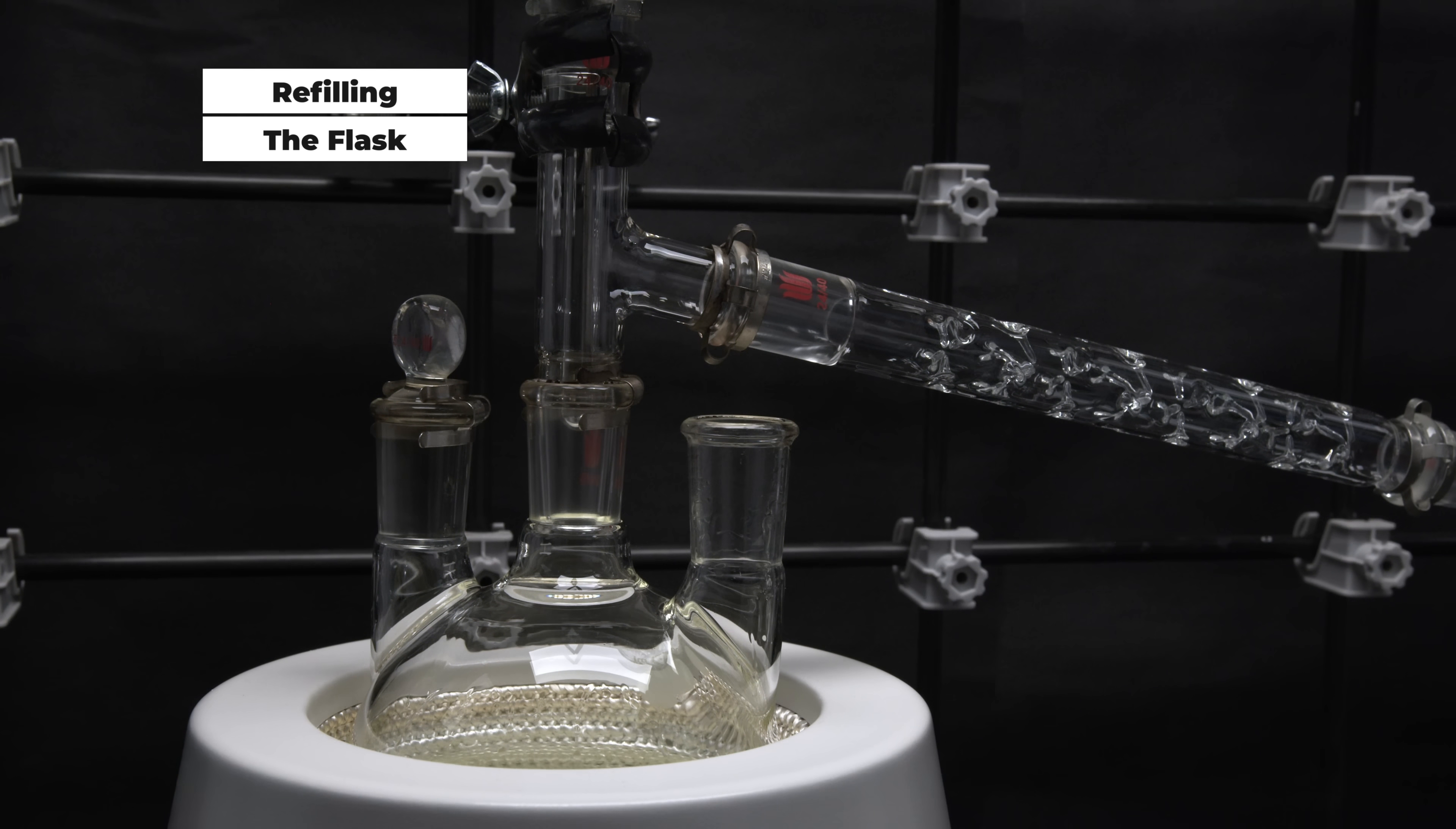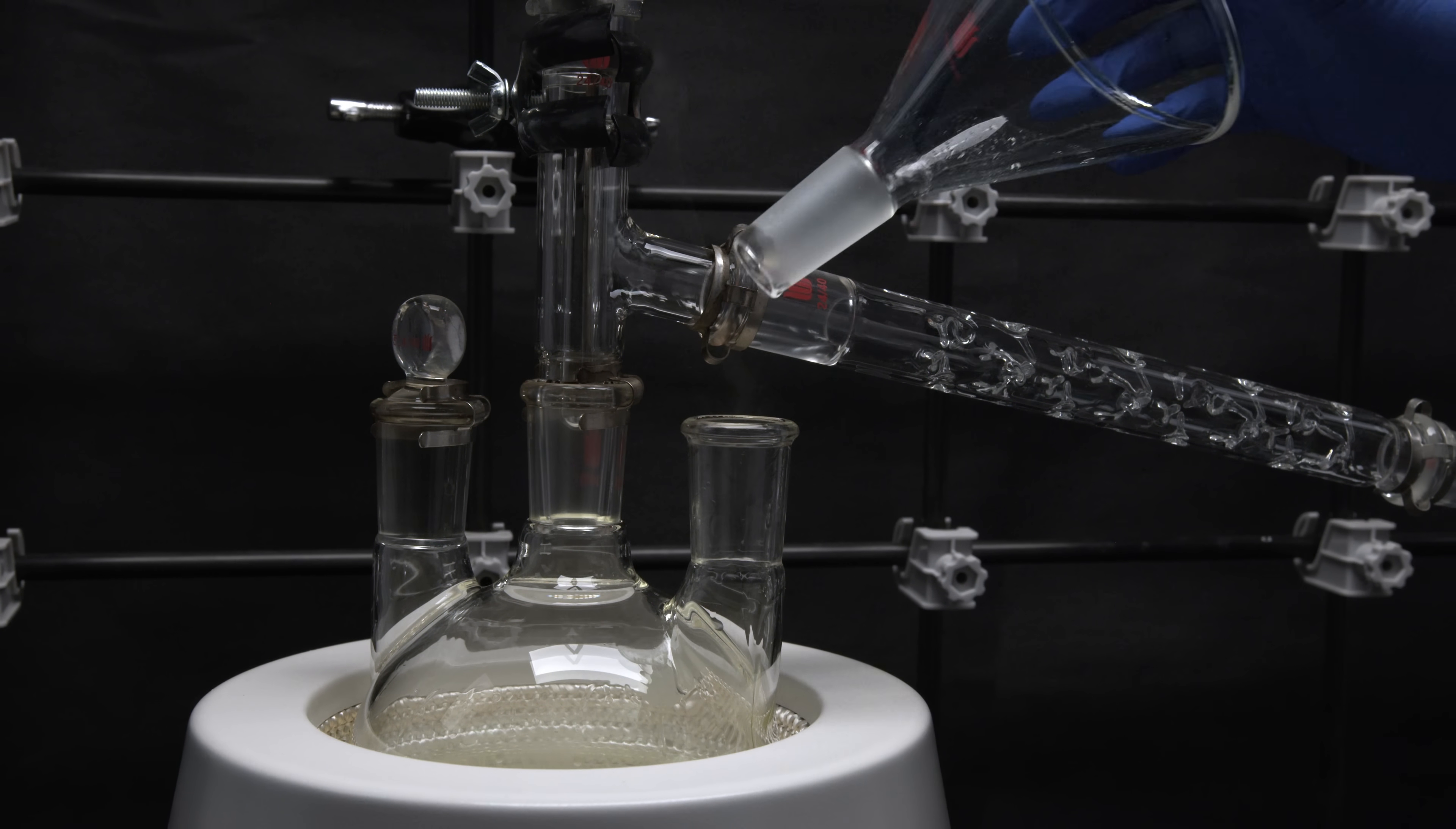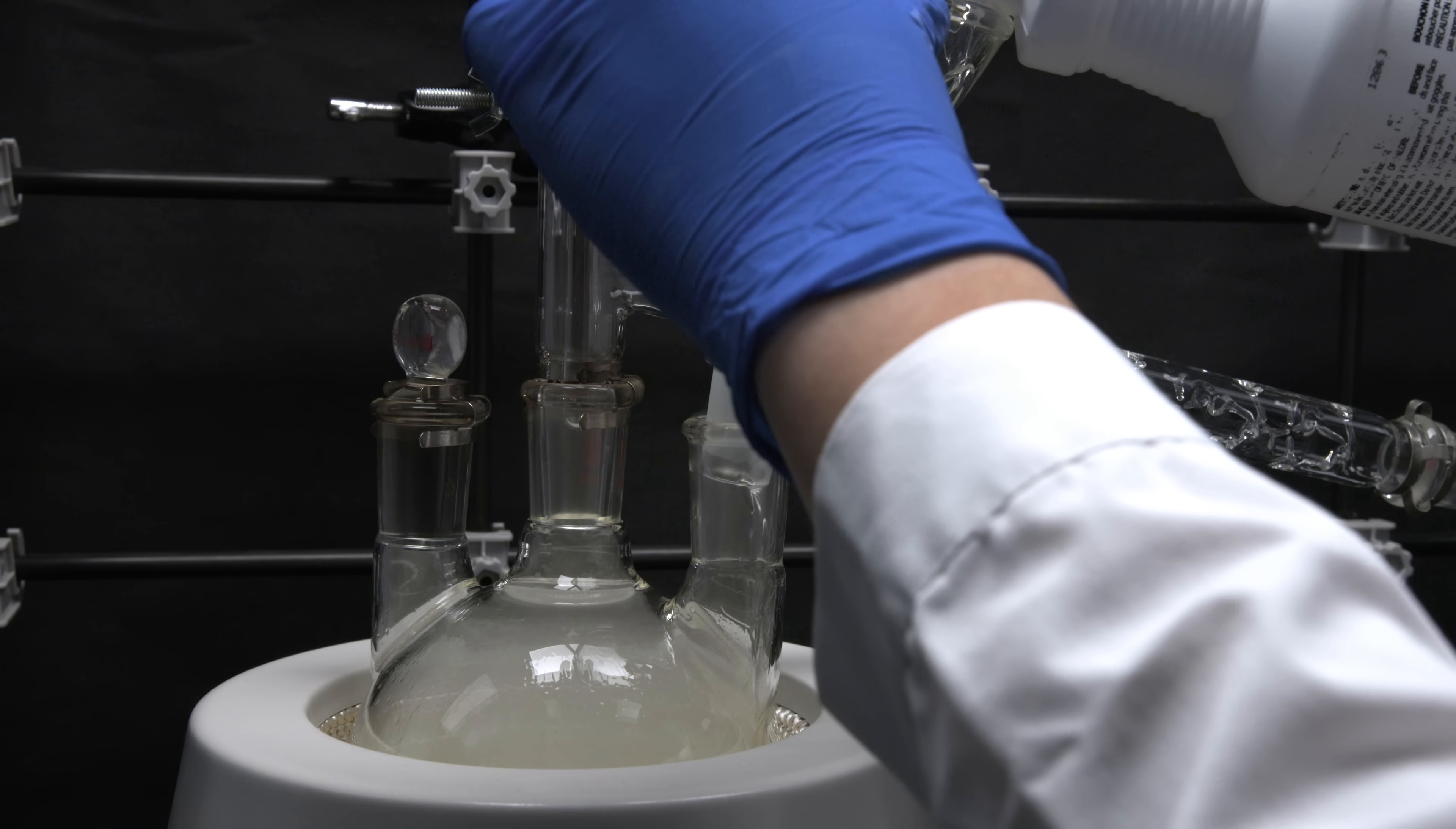Distilling a single batch of 500 ml of drain opener usually takes 5 to 7 hours. And I usually run multiple batches in a single run to save time. To do so, simply let the setup cool down and refill your flask using a funnel, and restart your heating again.